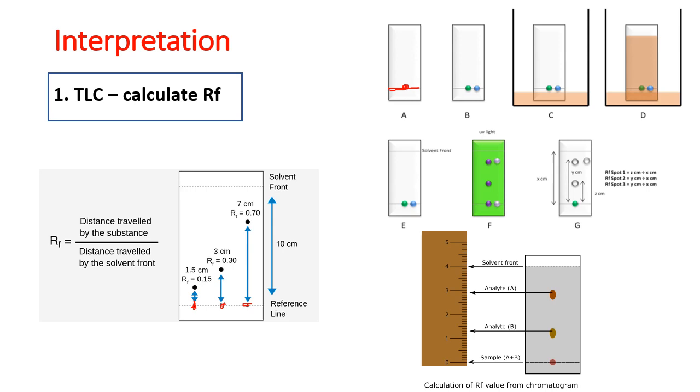And then I place this TLC sheet in a mobile phase that runs all over the silica sheet, and that will separate the components of the samples that you added according to the analytes that are found inside.